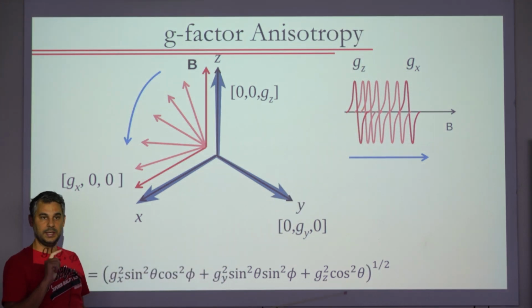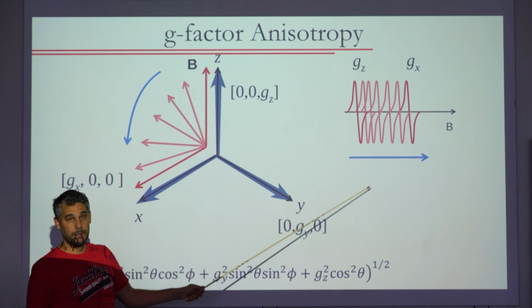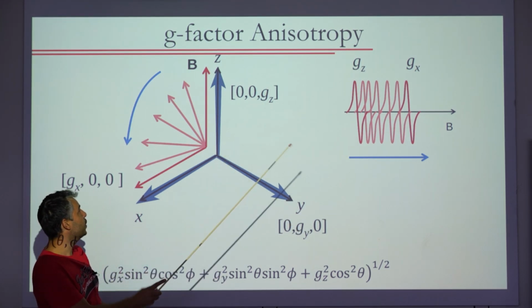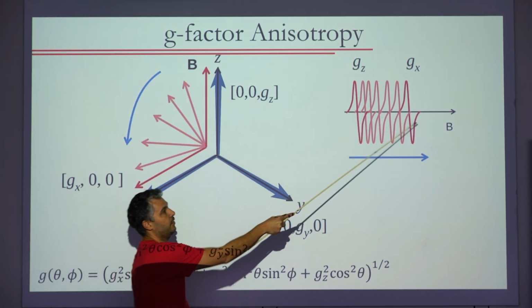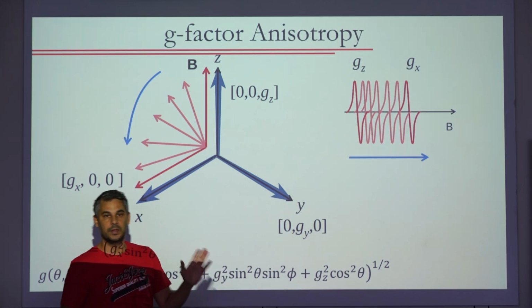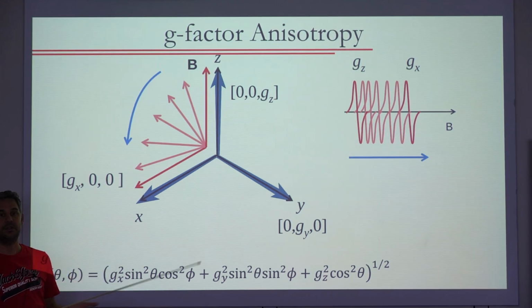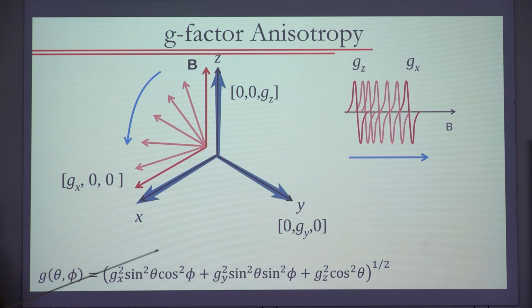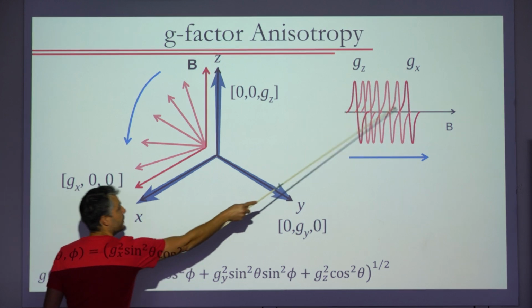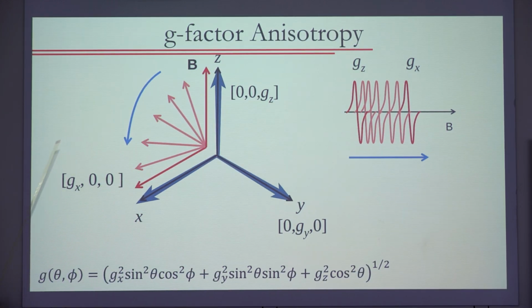Remember, the scale is opposite, so higher G means lower B. So while you sweep, you would see something like this. Of course, you see many more of these. This is only 6 or 7 orientations, but you have millions and millions of possible slightly different orientations. So you're sweeping something like this in the ZX plane.